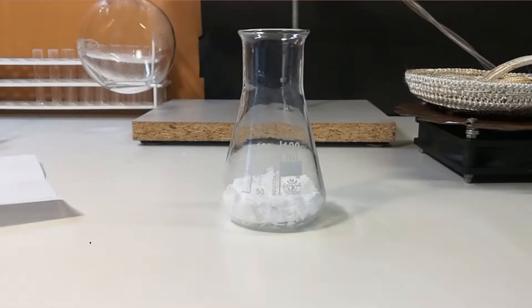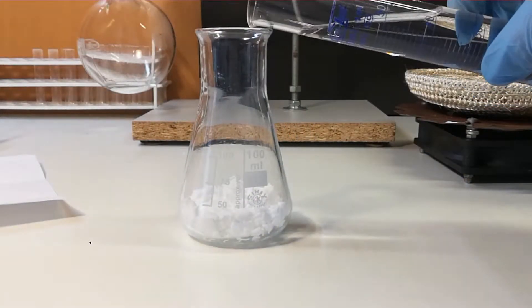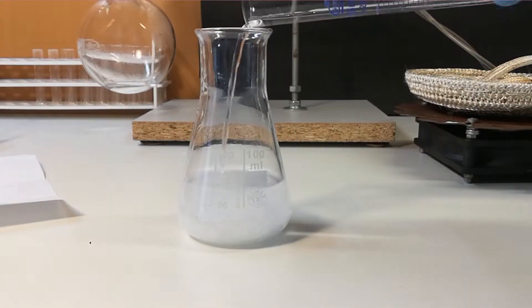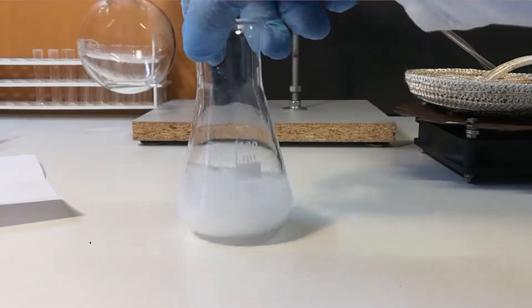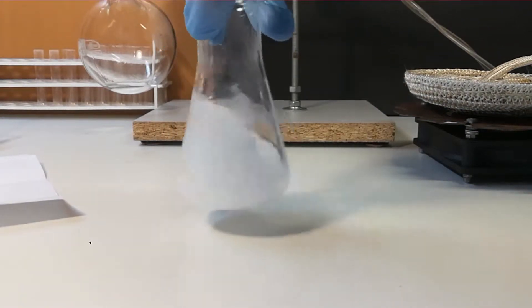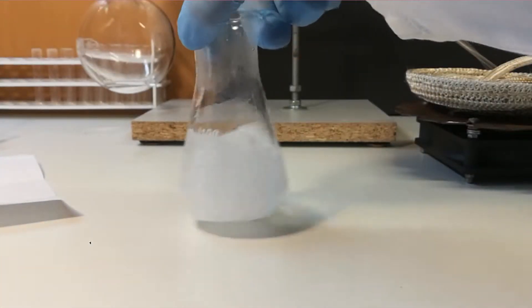Next thing is to make strong basic solution. To do it, weigh out 27.44 grams of potassium hydroxide and then add 50 milliliters of water. Mix thoroughly till mixture is translucent.